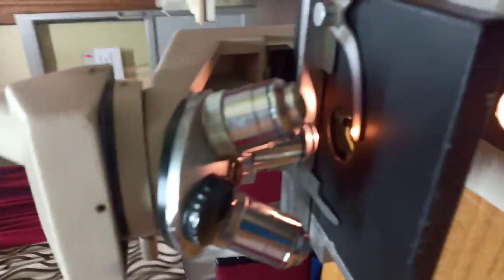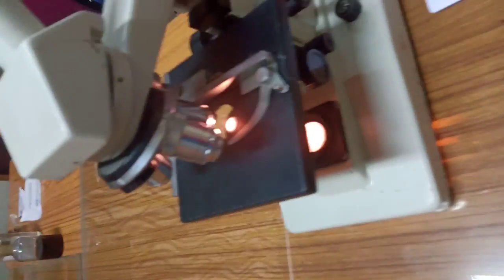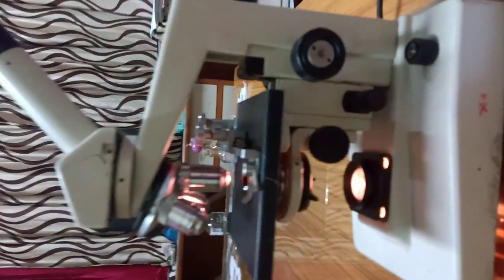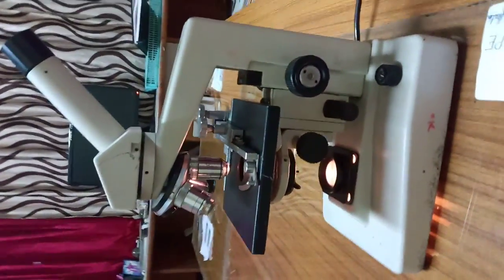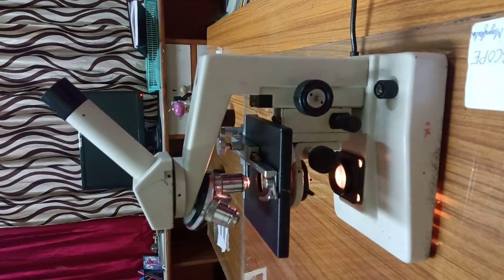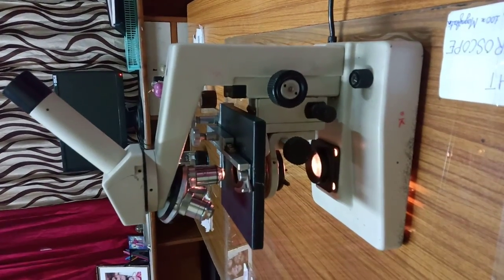Now, the microscope that you are seeing right now is an optical instrument which is used to magnify the objects, and the magnification of an object by an optical instrument means that the size of the retinal image, the image formed on the retina of our eye of the object under the view, is increased. The ratio of magnified image to that formed on the retina of an unaided eye is called magnifying power or magnification of that particular instrument.